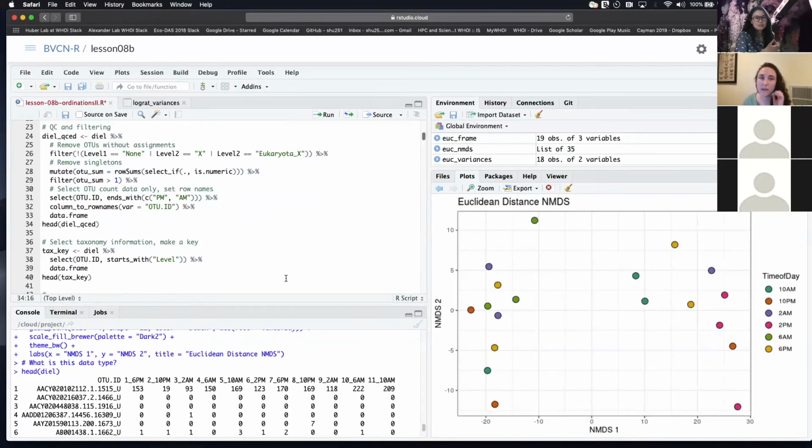No, not necessarily. I think, since you're talking about outliers, I actually have a question for you. When you are looking for outliers, are you talking about entire samples that you consider an outlier, or OTUs or ASVs? That is a great question. Right now, I'm talking about individual samples.